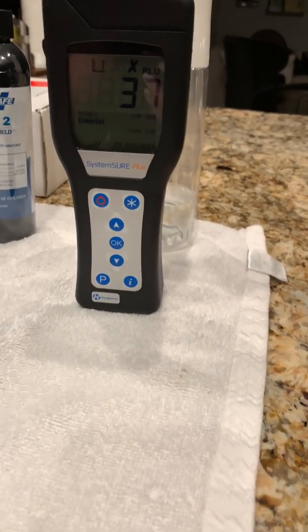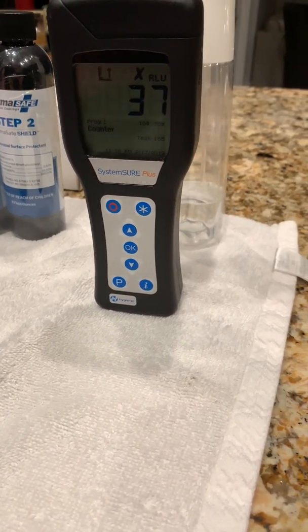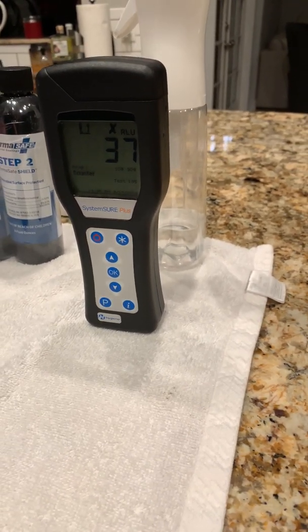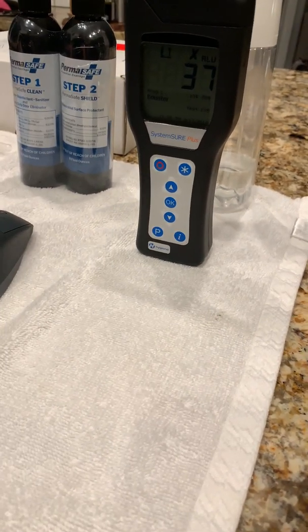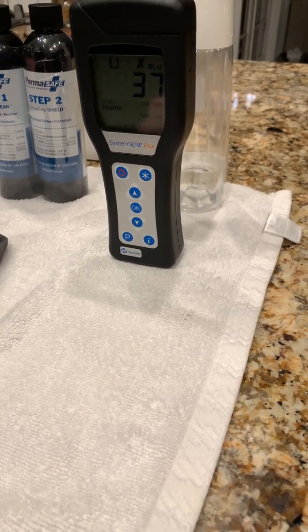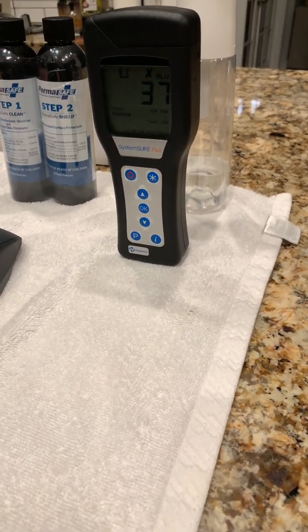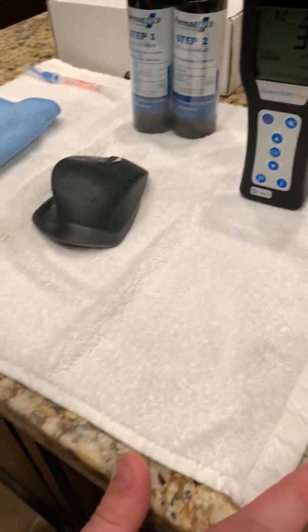We have an after reading of 37. That is obviously a fraction of the cure time and the treatment time that it requires — that's only step one, before step two treatment. We're a fraction of where we started, but that is a simple, quick version of an ATP test.